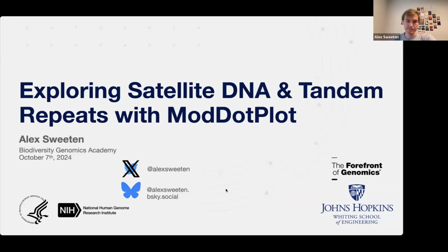All right, everyone. My name is Alex Sweeten. I'm a third-year PhD student at Johns Hopkins University, and I'm also a research fellow working with Adam Phillippy's group over at the NHGRI. And today I'm excited to explore some satellite DNA with you using ModDotPlot.